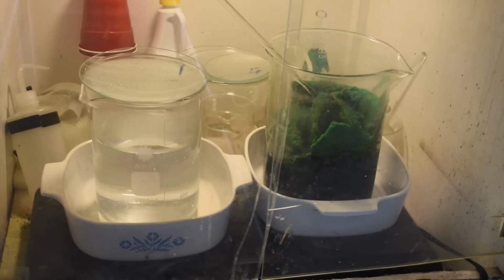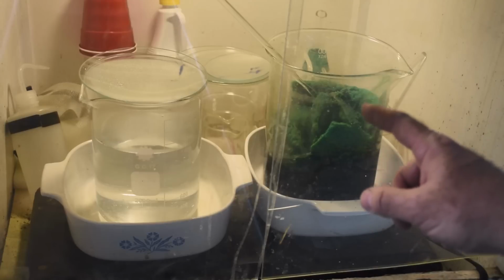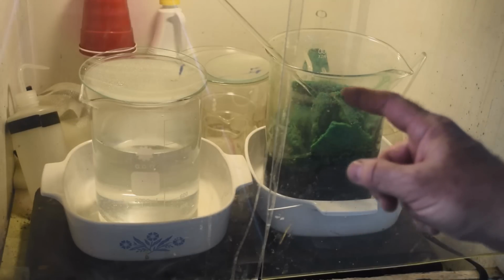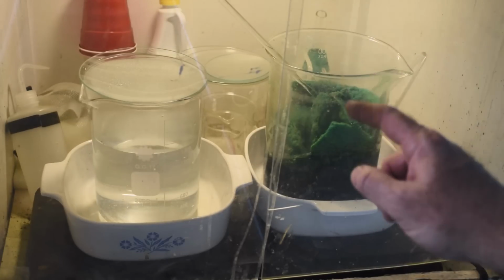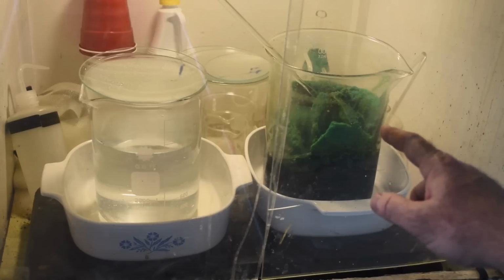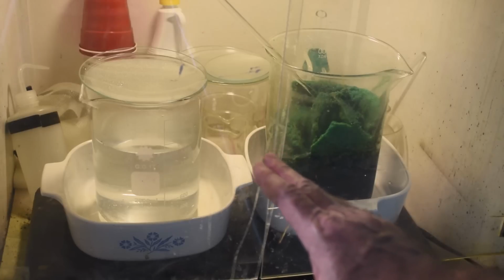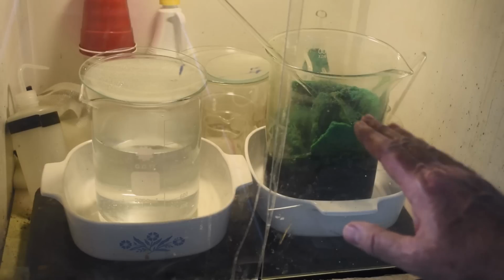All right, so I had a good long think about this over lunch, and I've come to the conclusion I'm going to use hot water on this and try and dissolve away as much of the sodium chloride, sodium nitrate, copper chloride, and nickel chloride as I can out of here. And hopefully, the palladium chloride will stay behind as a solid in the bottom of the beaker. My reasoning here is I've got to deal with this solid stuff someday, and well, might as well be today because I've got the time today to work on it. So I'm going to heat some water up good and hot. I'm going to pour it over this stuff, and we're going to see what happens.